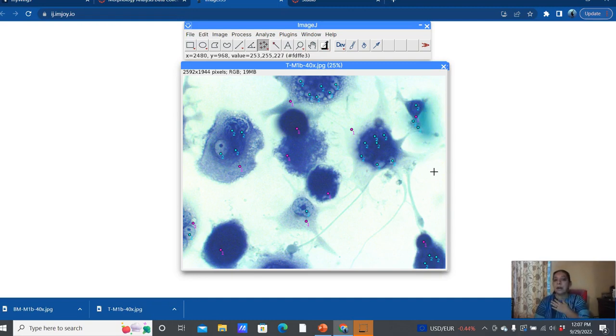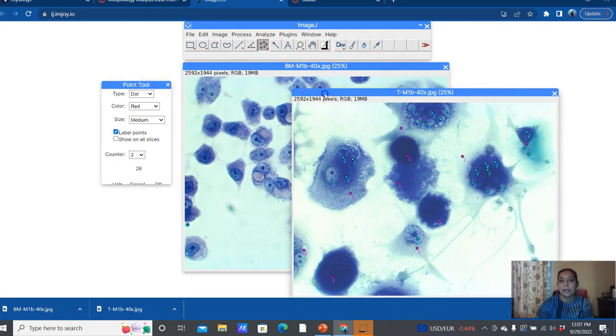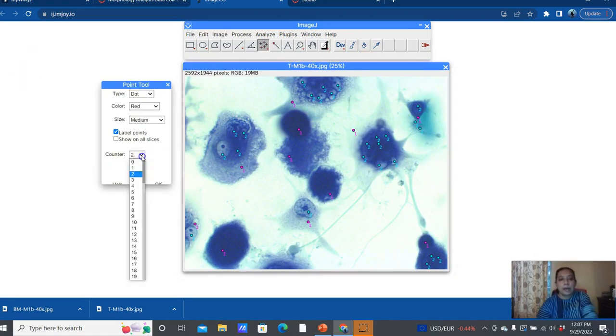Now maybe the third observation that I'm going to make is how many of these cells were either anucleated, that is, they did not have a nucleus, or that they were multinucleated, had a lot of nuclei inside, right? That's another thing I can make observations on, so I would double click on this again. I lost my chart because it went back. Let's get it out. Sometimes that happens, it goes behind your screen and you don't see it, especially if you're magnifying and reducing. So you want to make sure that you go back and find it.